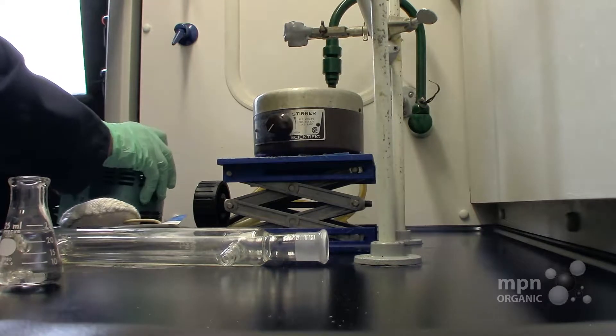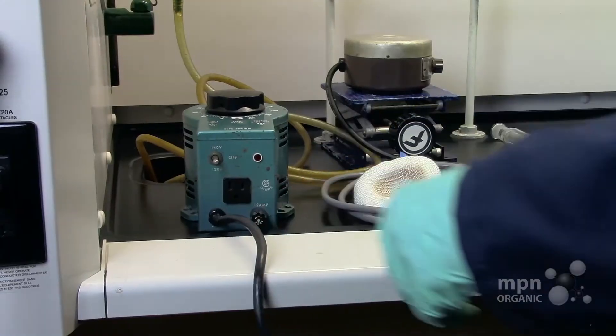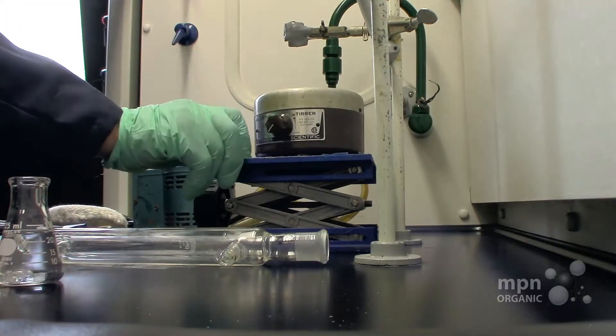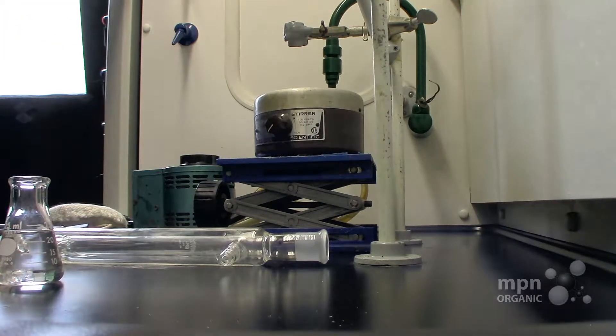First of all, we have to have what we call a variac, which is going to be our power supply. Then we're going to have a heating mantle, a stirring motor, and a lab jack. Let's see how we do this.